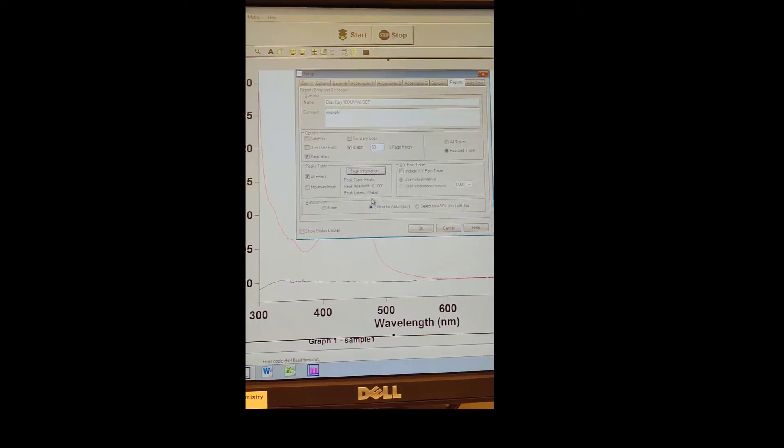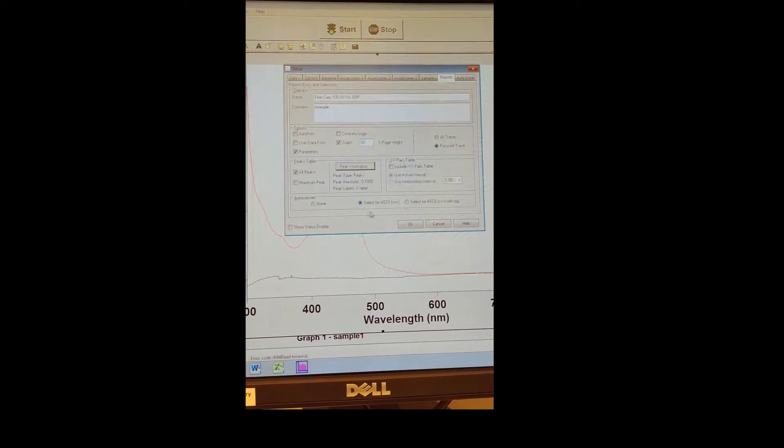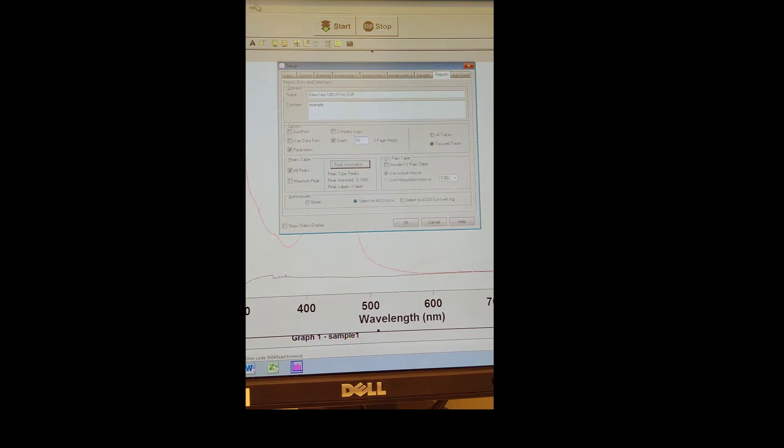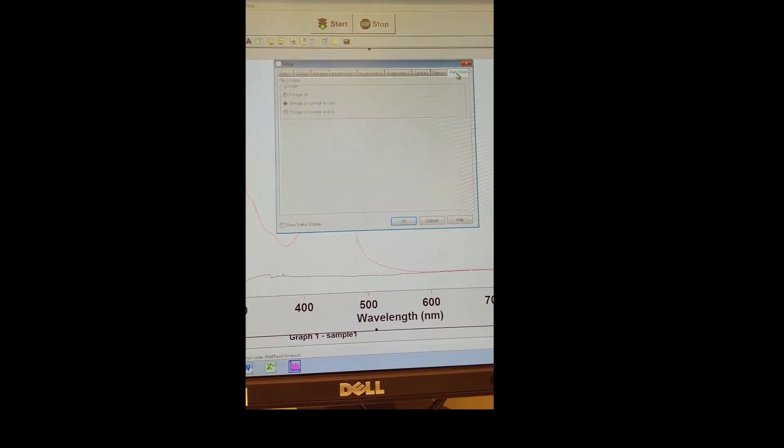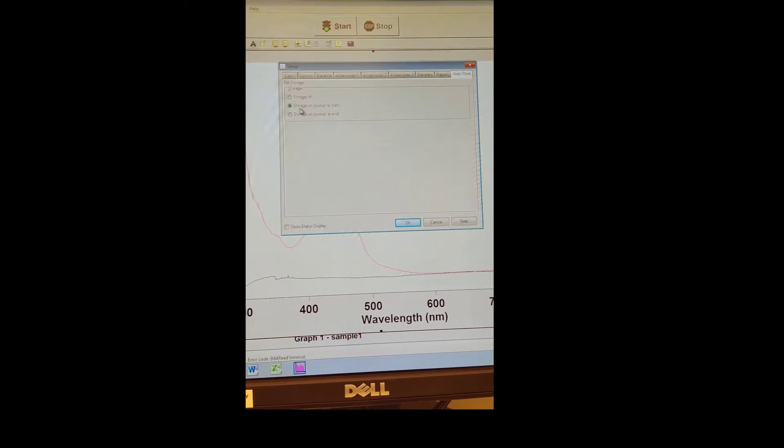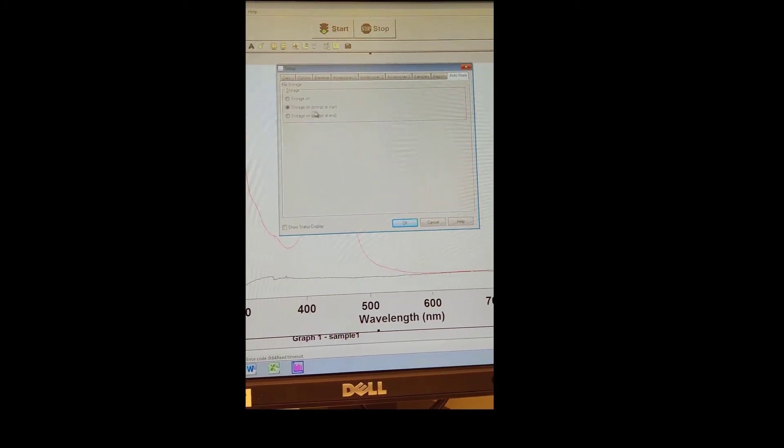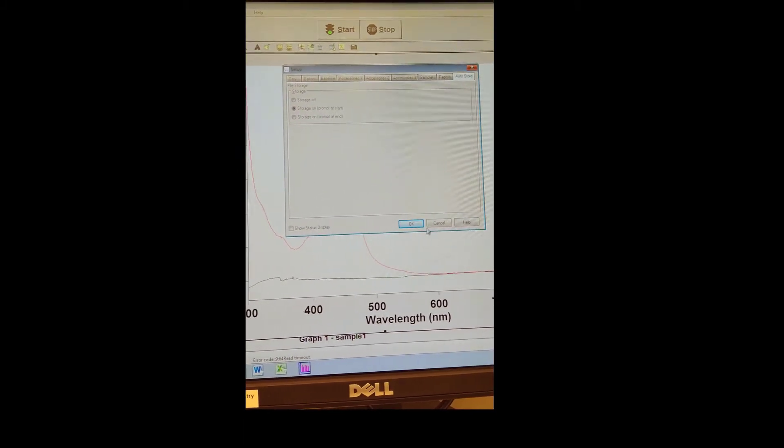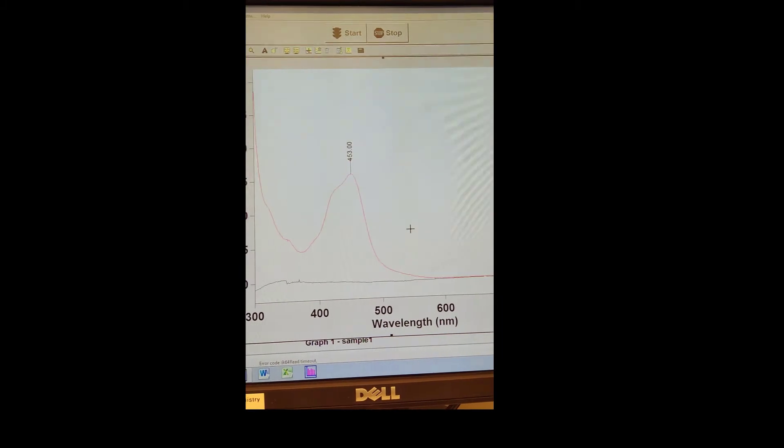Under Auto Convert, this is really important. Make sure that you select for ASCII CSV so that you generate a CSV file in addition to the raw data file. Under Auto Store, select Storage On and then Prompt at Start. Hit OK.